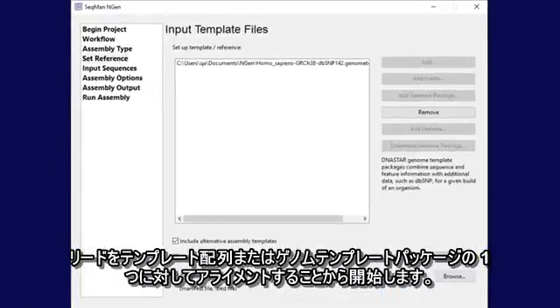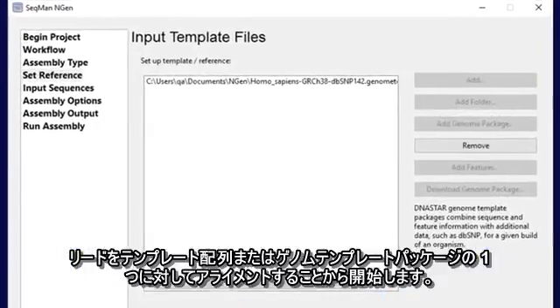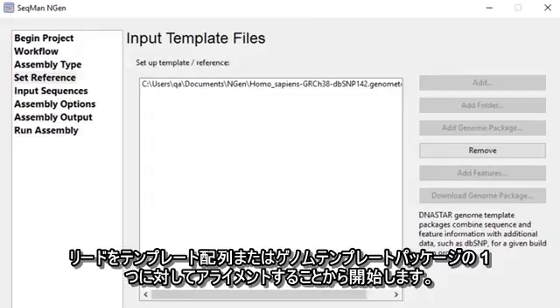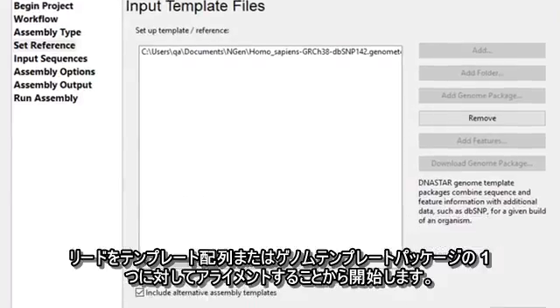Start by aligning your reads to a template sequence or one of our genome template packages.